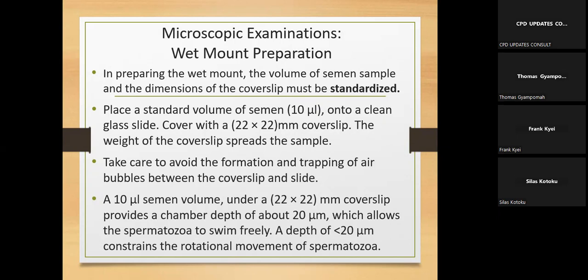The cover slip we are talking about here is the same cover slip anybody uses anywhere. The cover slip is the same, 22 by 22. I'm saying that sometimes people just write cover slip and you don't even bother to find the dimensions or specifications. The normal one you're using is 22 by 22, and you have 22 by 30, 22 by 32, 22 by 40.